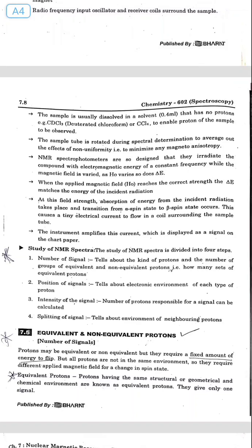In NMR, chemical shift is very important. Not all nuclei absorb RF radiation at the same frequency. This is because electrons around the nucleus shield it from the external magnetic field. Chemical shift definition: chemical shift is the relative position of an NMR signal compared to a reference compound. You can see this definition is very important for your exam. It is expressed in ppm, parts per million.